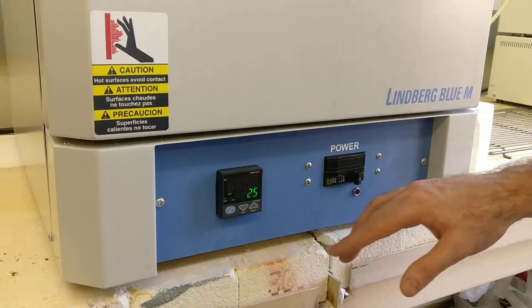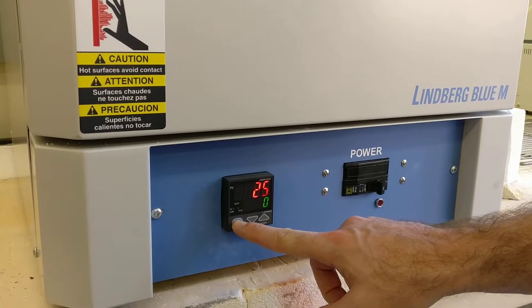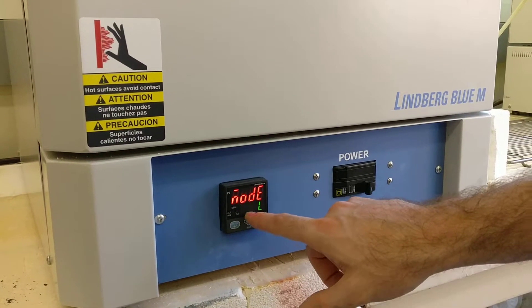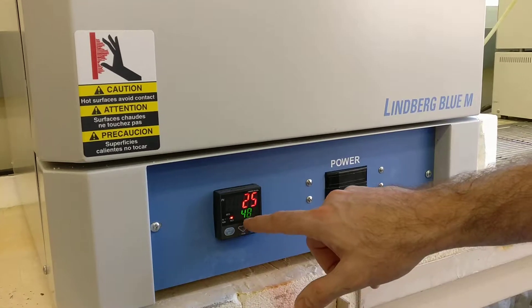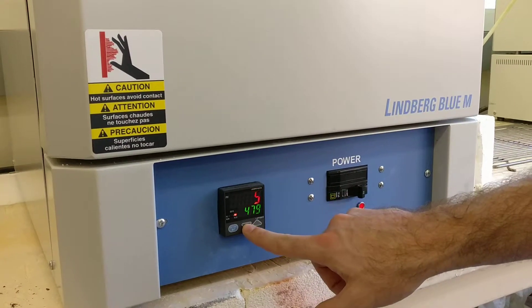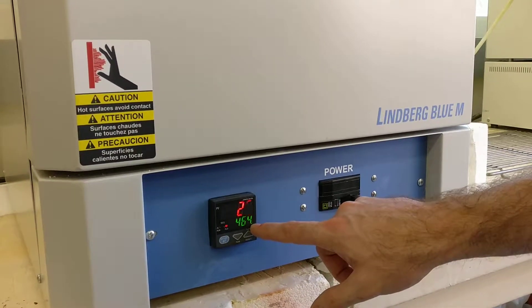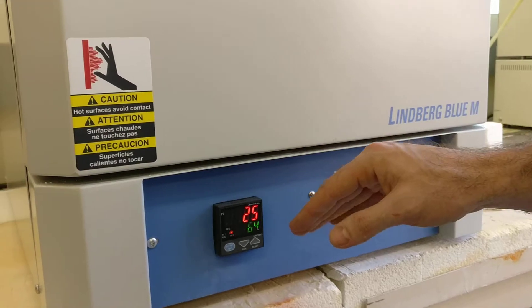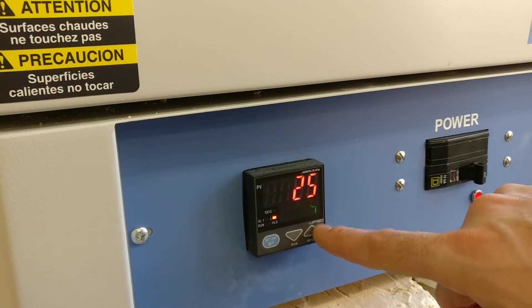If we just want to set it to a temperature and have it run, we hold this blue button. We go up twice — this is for local. Hit blue again. Notice the heater's on, and this is now a live temperature that we can adjust to whatever. As we adjust, we see this blinking light here — this means that it's not currently set, so if we left it, it would not put in that temperature. Once we push the blue button, it sets the temperature.